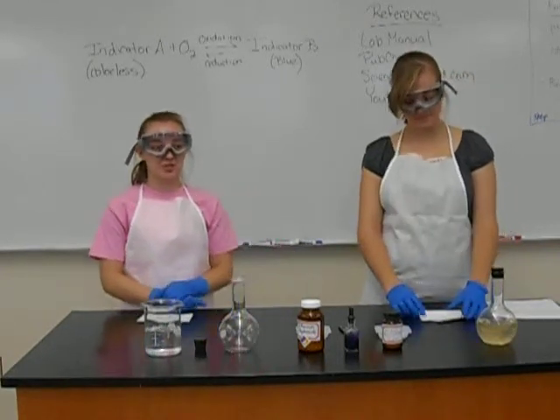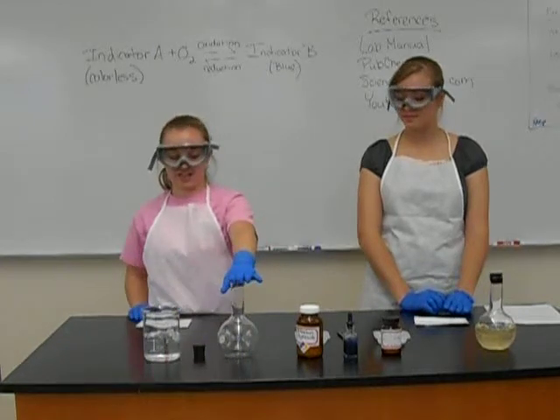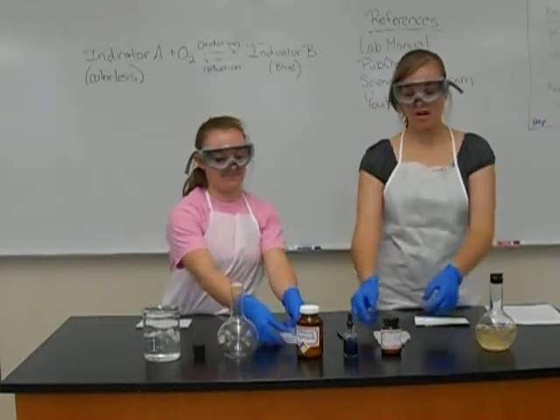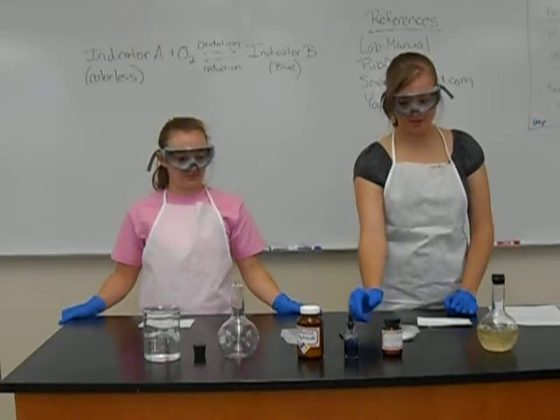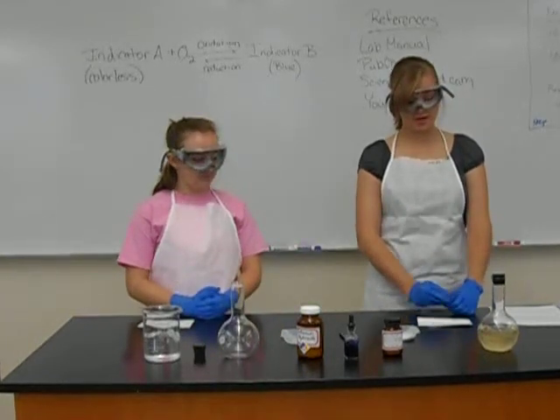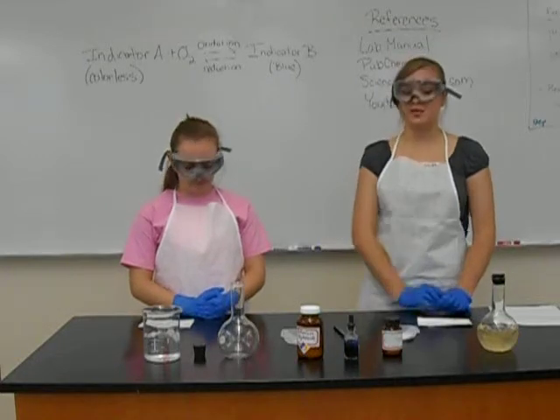And today we're going to be doing the methylene blue traffic light experiment. And to start off, we're going to need a 500 milliliter Florence flask with a stopper, 300 milliliters of distilled water, and 8 grams of potassium hydroxide. We'll also need 10 grams of dextrose, 6 to 8 drops of methylene blue indicator, and for our experiment we're going to use 7. And according to pubchem.gov, methylene blue indicator is a dye used in paper, cosmetics, and other products. We'll also need a spatula, goggles, gloves, and an apron.